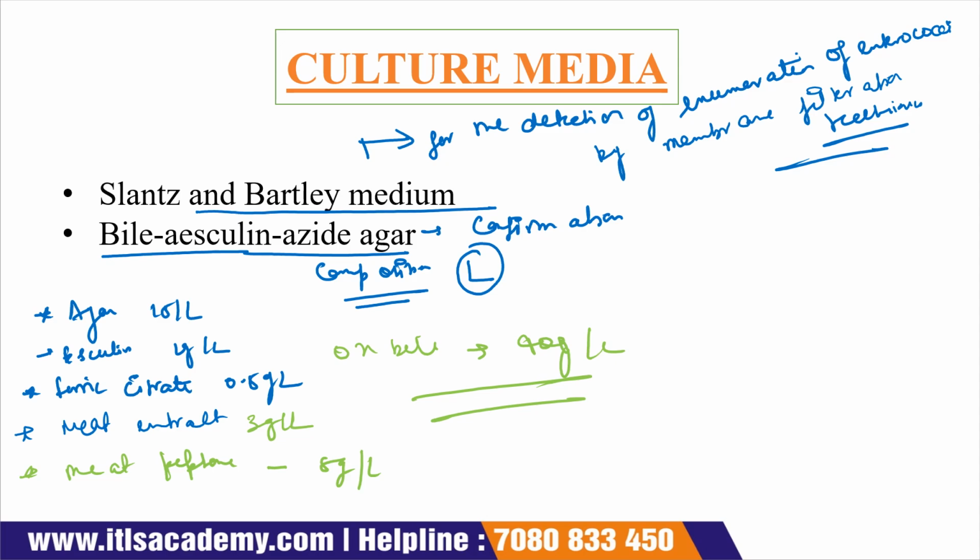So this is the composition for bile esculin azide agar. Then we maintain the pH of this bile esculin azide agar at around 6.6, and this pH will be maintained with the help of a pH meter.